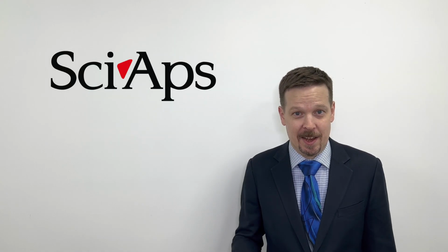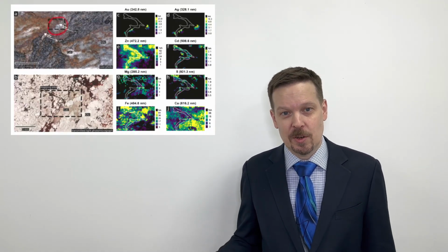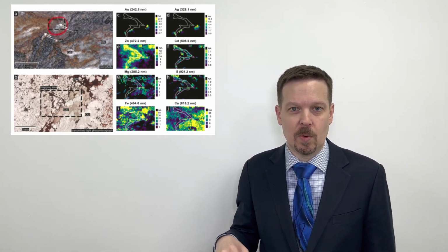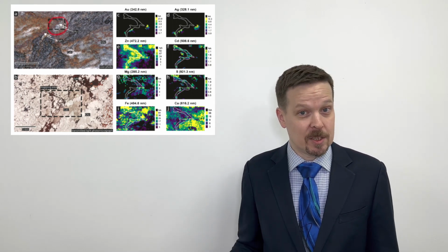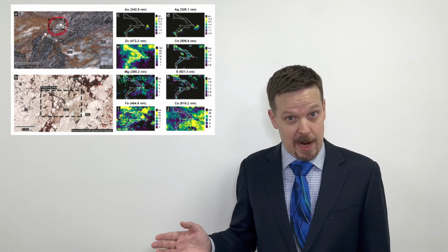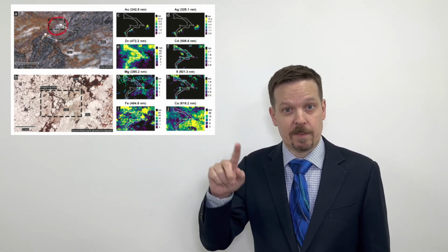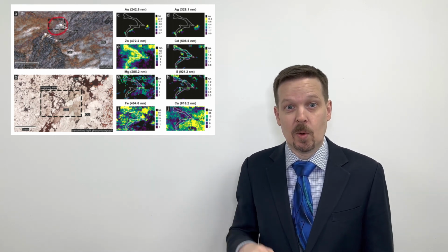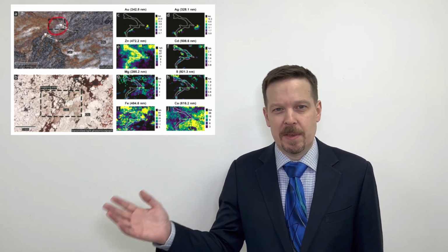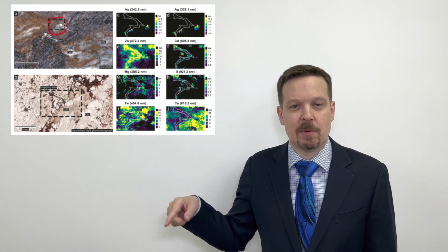Another aspect of the qualitative analysis is using Geochem Pro. And in Geochem Pro, you can do mapping of the surface of any stone or geological sample that you would like to look at. This is often done in gold mining. And what they do is they'll look for a gold vein. First of all, identify the gold in the sample, whether or not it's gold, maybe pyrite, maybe it's neither. And then they will look at what is surrounding the gold.